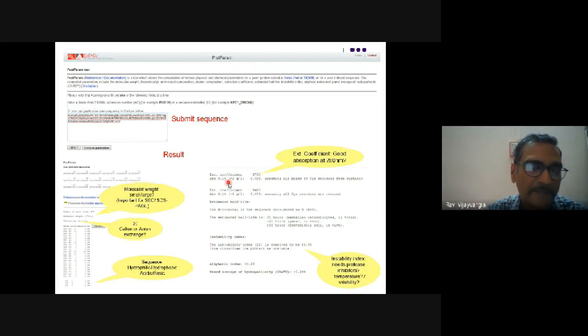So what information can be seen in this result? It will tell about the molecular weight of the protein, which tells about the size of the protein. That is important for deciding the resins to be used for size exclusion chromatography, and in SDS-PAGE where to look for your protein. Also, it will give information about the pI. pI is the isoelectric point. Do you know what the isoelectric point is?